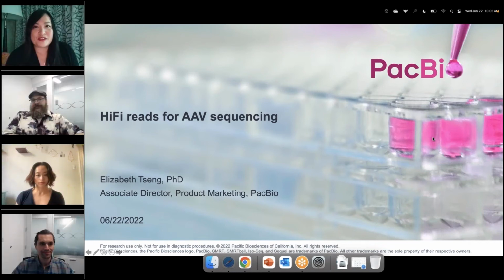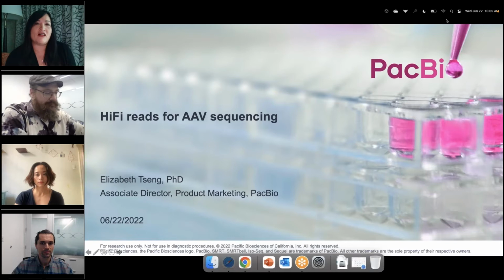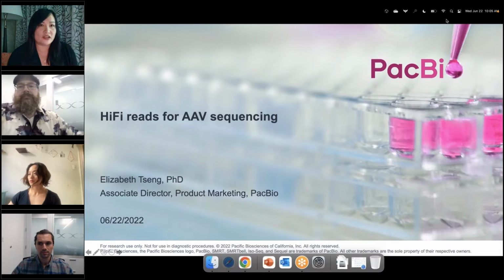Hello, everyone. I'm Tran Dahlin, PacBio's Director of Emerging Applications, and I want to welcome everyone to the PacBio webinar series, with today's topic focused on understanding the challenges of AAV sequencing and how experts in the field of gene therapy are using HiFi reads for better and more efficient vector design and quality control.